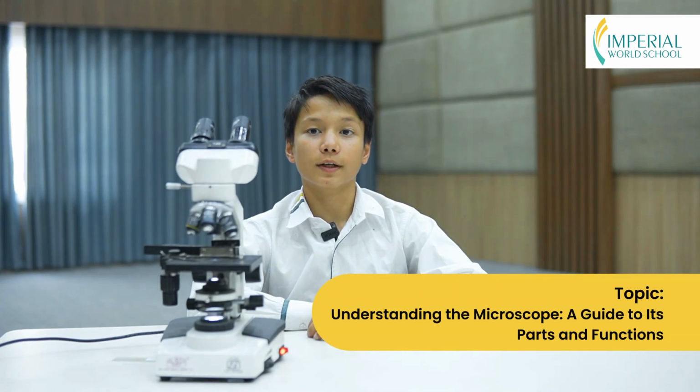Explanation about compound microscope. So what is a compound microscope? A compound microscope is an instrument that helps us to see magnified images of small specimens on a glass slide. So why do we call it compound microscope? We call it a compound microscope because it has two lenses which helps us to see magnified images of specimens.